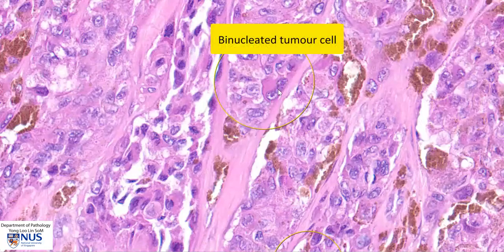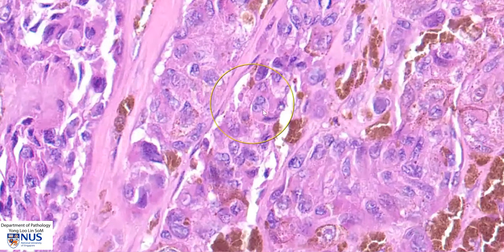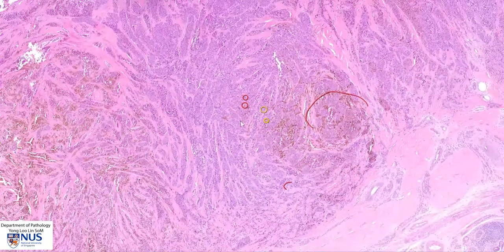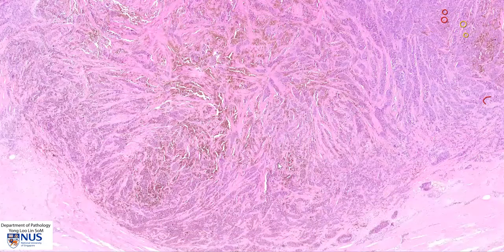Here we see a binucleated tumor cell, which is also fairly commonly seen in melanomas, and there is another much smaller but also binucleated tumor cell. So we have these sheets and nests of malignant polygonal cells infiltrating into the dermis, and some of the cells have cytoplasmic melanin pigment.